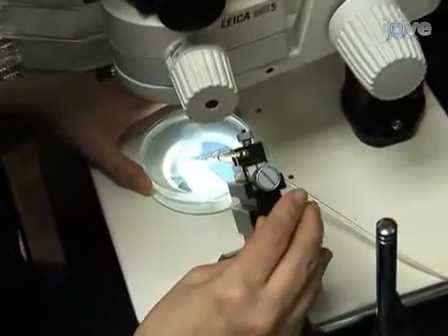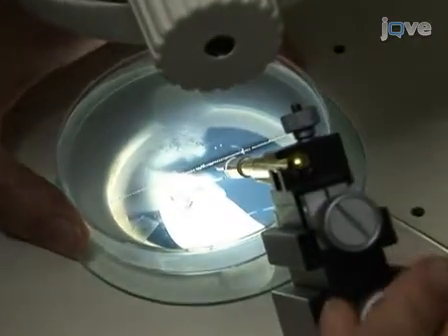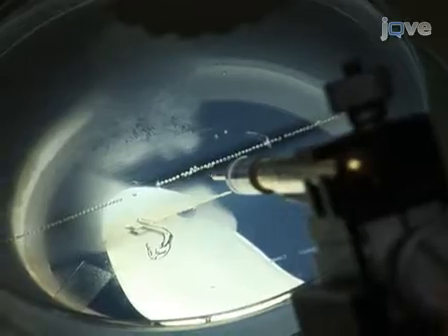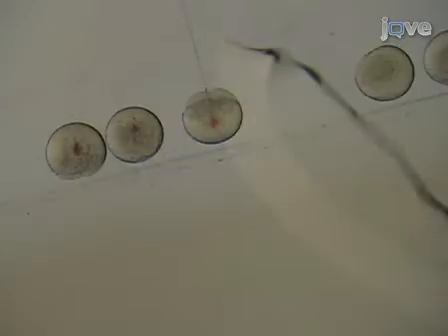It is important to inject into the yolk streams so that the dye is transported into the cells. This injection will be sufficient to track cells in chimeric embryos through several days of development. Ideally, we do this before the cells reach the 4-cell stage.